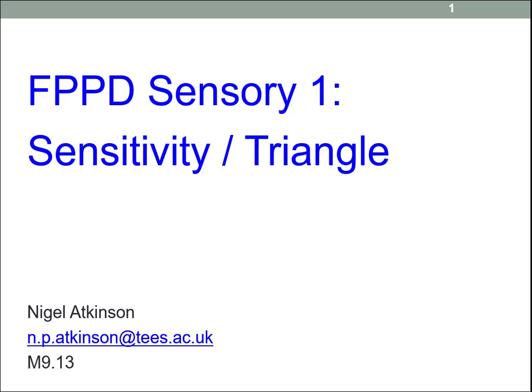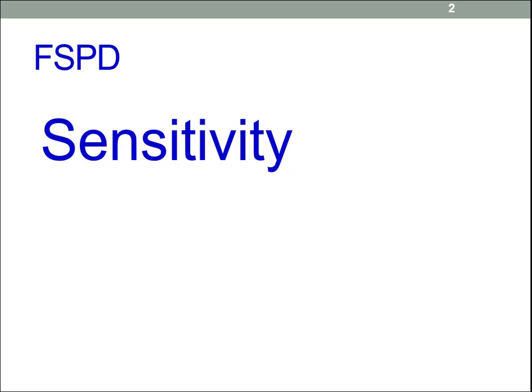Right, okay, so a look at the first sensory lab, which will cover sensitivity in the triangle test. This is of course covered in detail in the relative British Standard, and you will be looking at it for the open book resource for the exam.